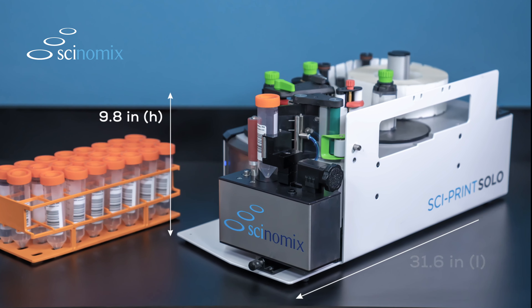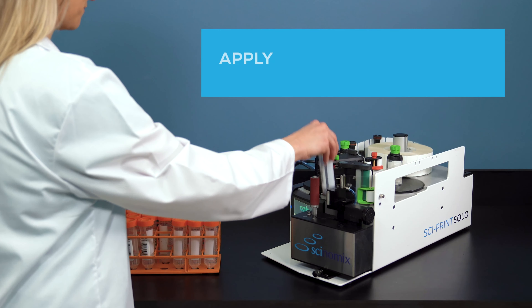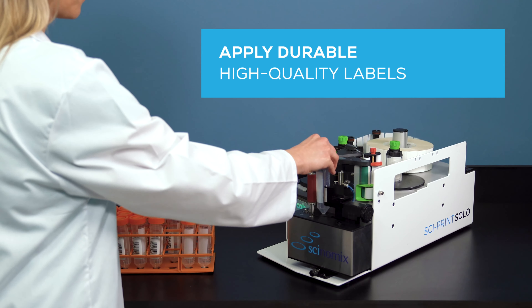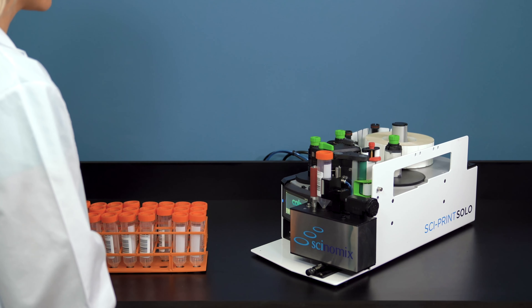Easy to use, easy to load, and fast. The space-saving Cyprint Solo is able to quickly apply durable, high-quality labels for your specific tube applications with consistency and accuracy. With its user-friendly software and configuration, the Cyprint Solo eliminates risk of human error that can occur from hand labeling.